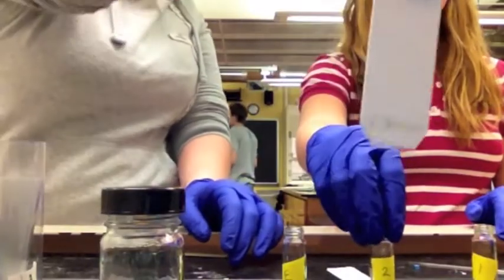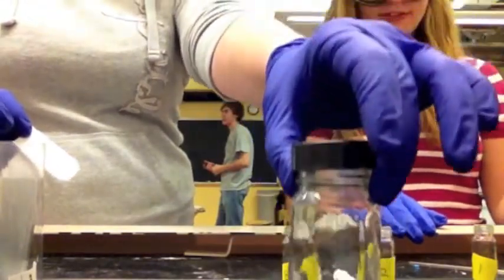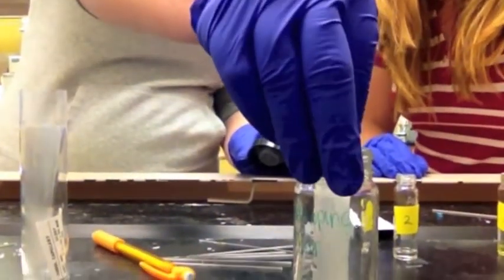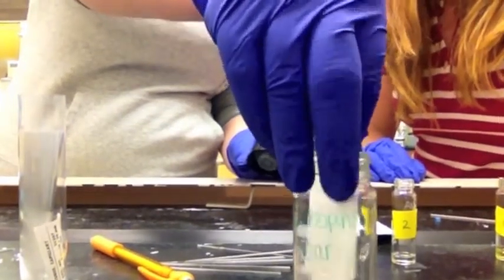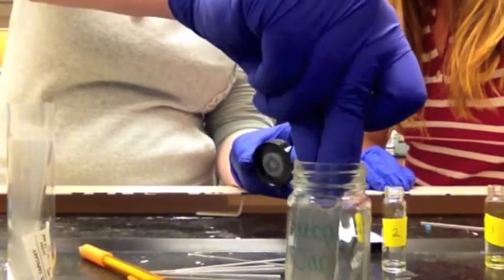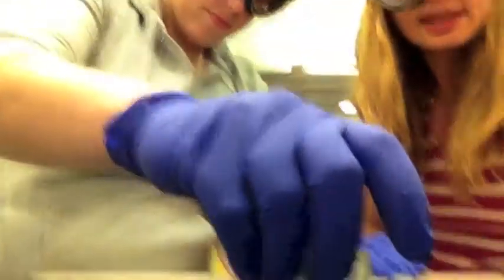Now the plate is dotted. Now we are ready to develop our plate. Here is our developing jar. We have placed a solvent in the bottom, but it does not come past your starting line. We carefully place it in the jar, lean it back, put the cap on.